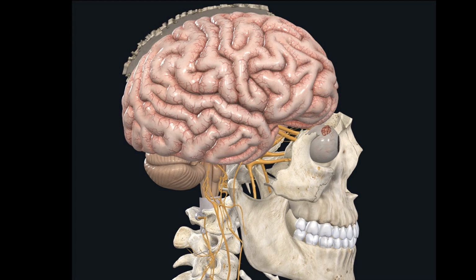As you have now realized, the central nervous system consists of white matter and grey matter, distinguished because of the distribution of myelin. The brain is organized histologically in a very particular way and is different to what you have just seen in the spinal cord. Grey matter occupies this convoluted and thick surface of the cerebral cortex and the cerebellar cortex.